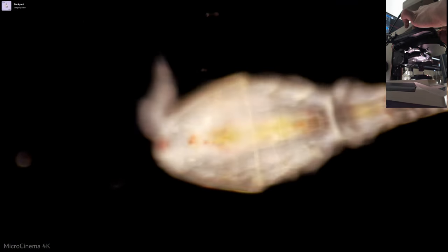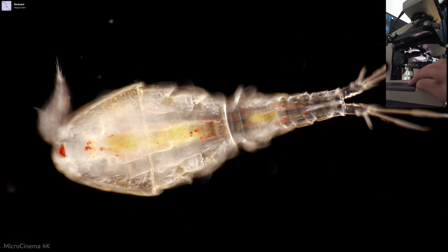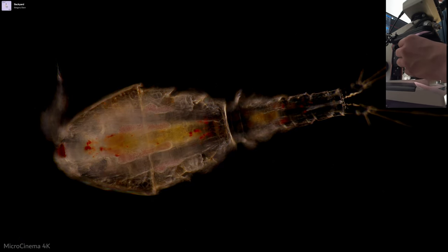And so I'm going to back off again to the 10X here and I'm going to show you again. Now I can pull the... actually what I'm going to do, I'm going to drop down my exposure first so I don't blind anybody.